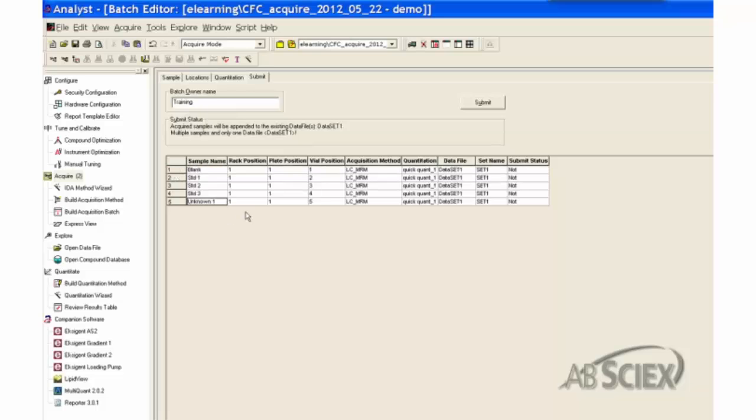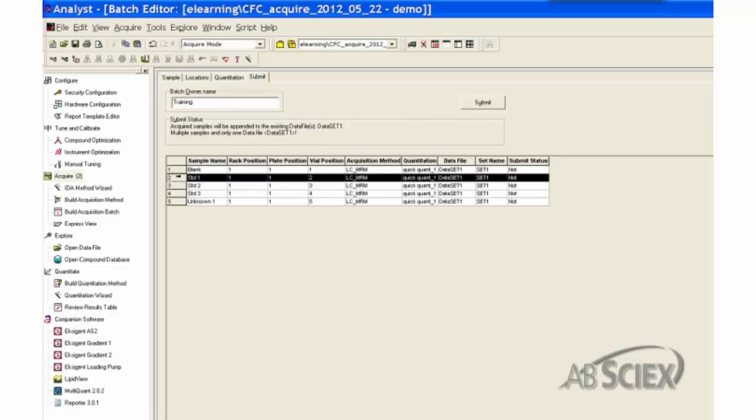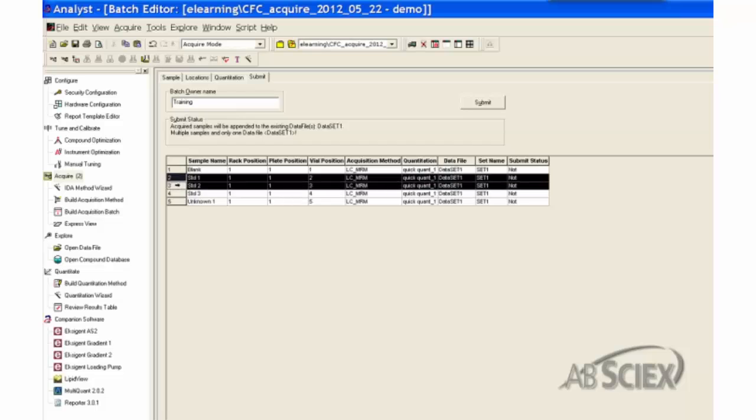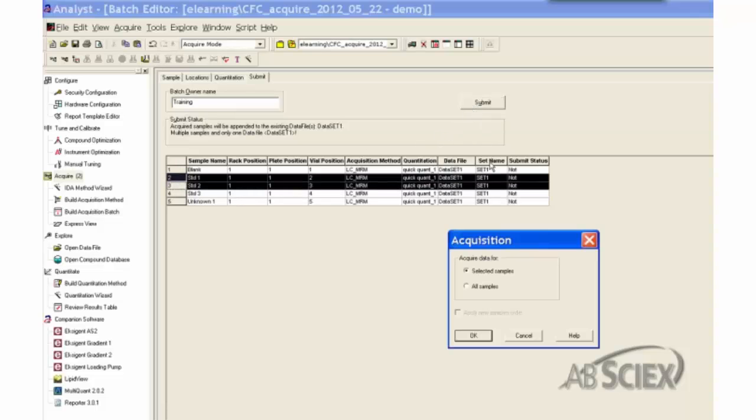We can submit the whole batch by simply clicking the submit button. To only submit selected samples for analysis, highlight the desired samples in the batch and click the submit button. In the pop-up acquisition dialog box, choose Acquired Data for Selected Samples option.